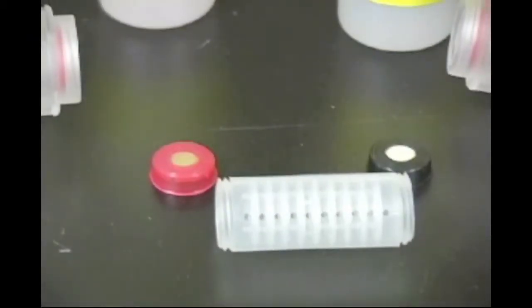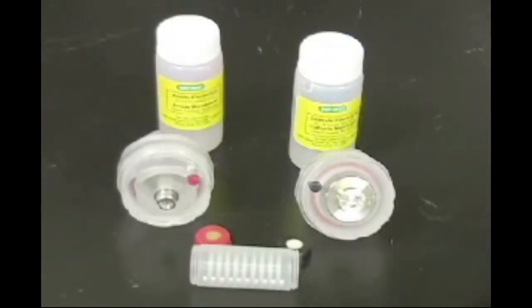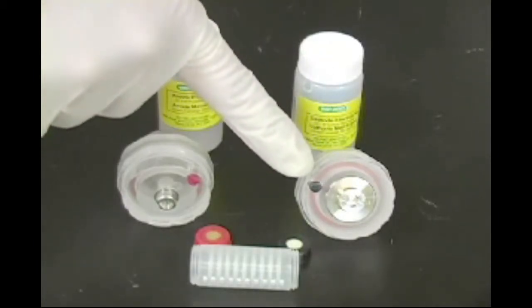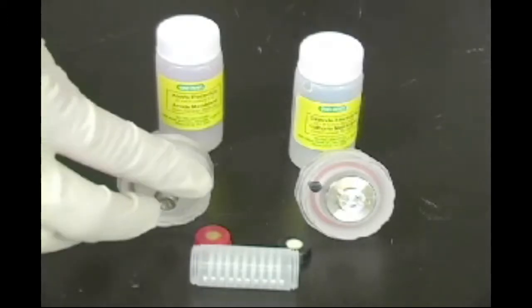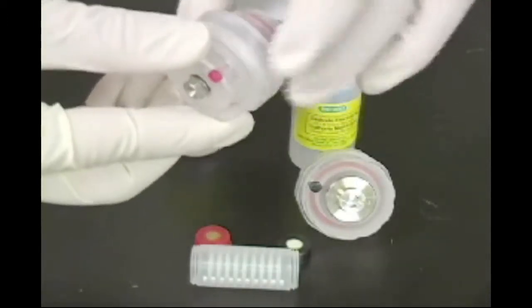The electrode assemblies consist of an anode designated with a red button and a cathode designated with a black button. Each electrode chamber has two components, an inner and an outer component, that are joined together with a threaded sleeve.